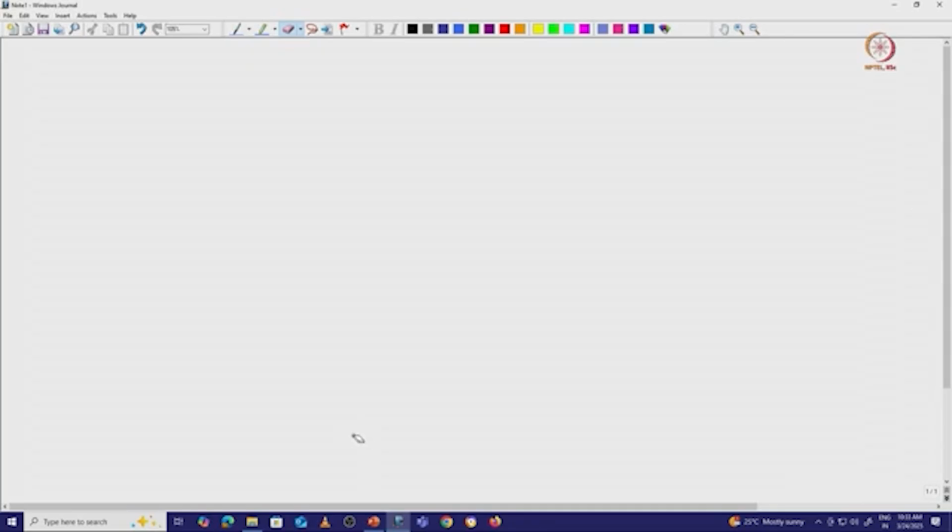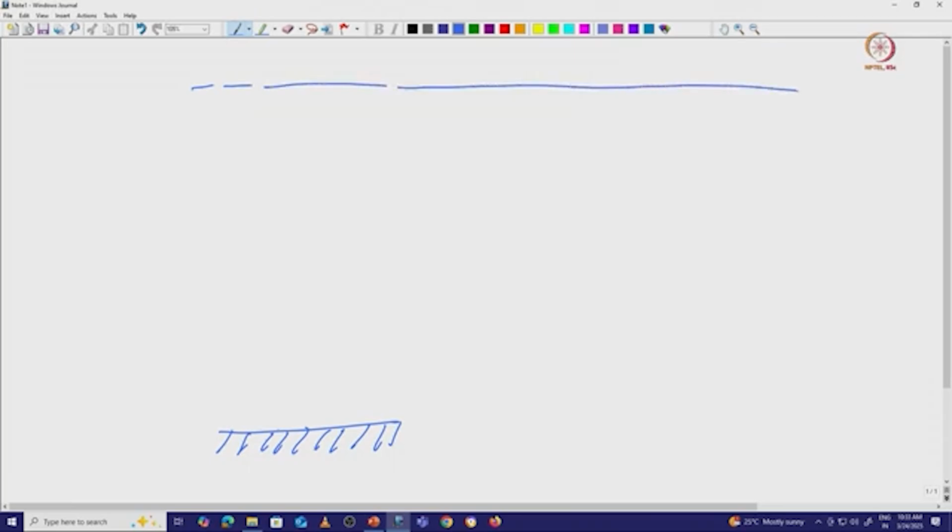So, if we just consider that, okay, here we have a metal, this is the metal surface. As I told already, for the metal surface you need some kind of energy which will allow your electron to detach from the metal, and then it will get some kind of velocity. So, I will just draw a line like that which will help us to draw the rest of the thing. The work function of this metal, you just consider Phi W, for the tungsten filament we are drawing at the beginning.